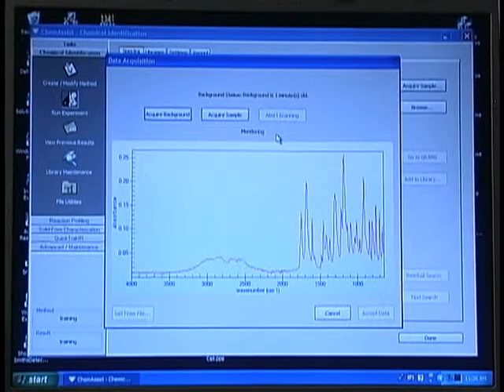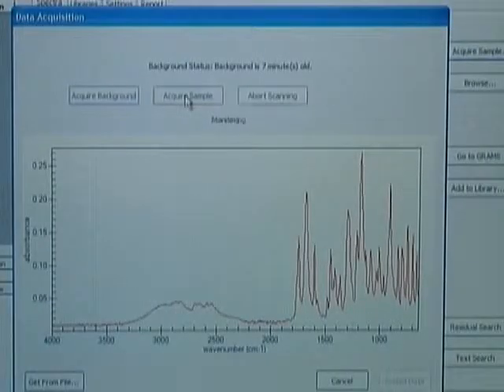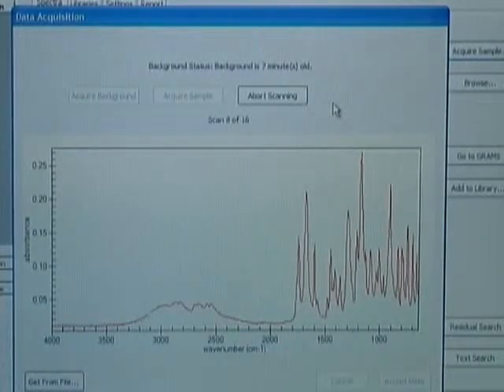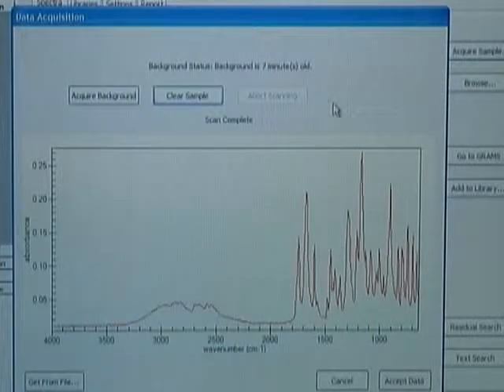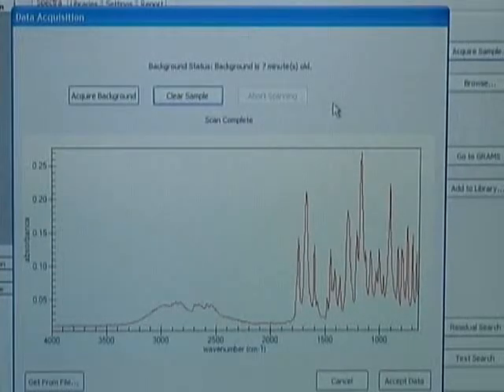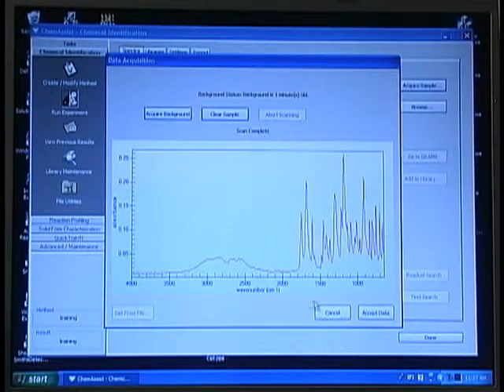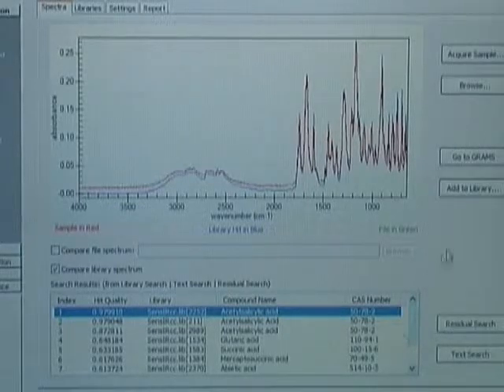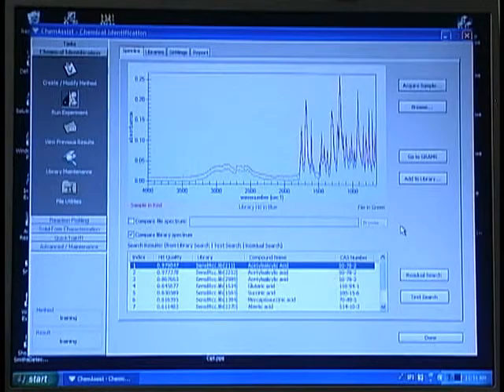When you are satisfied that the sample spectrum looks appropriate, you click on Acquire Sample. The system will indicate that it is scanning, and you can see in real time the spectra being collected. When it is finished, the window will say scan complete. If you are happy with the spectrum, you click on Accept Data. At this point the spectrum will appear along with the best search result from our library.